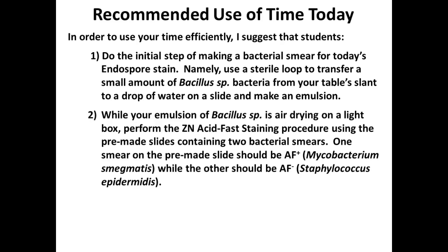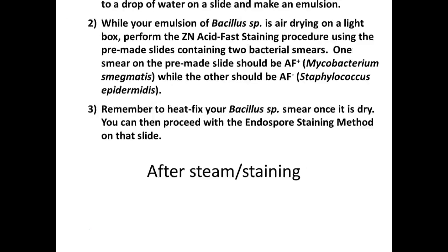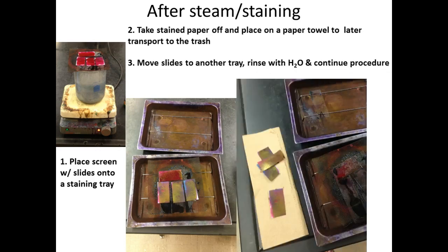And this is what I just said. As I said, after you get done, take the screen, put it away, and then each person take a slide. It really doesn't matter which slide you get, because they're all going to be the same on each lab bench. We're all going to do them together.